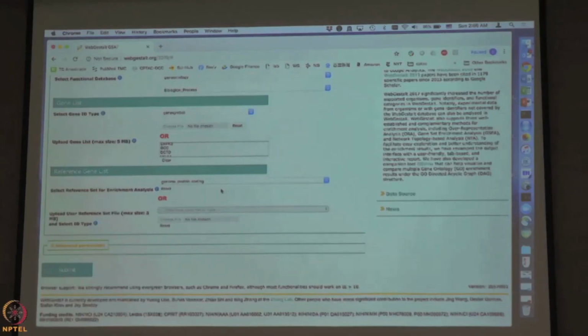So for a lot of proteins you didn't have the opportunity to get the statistics, and then you should limit your search space, or the background reference space, to those proteins you can actually analyze. This is very, very important.